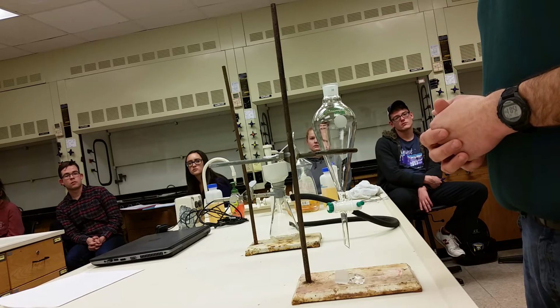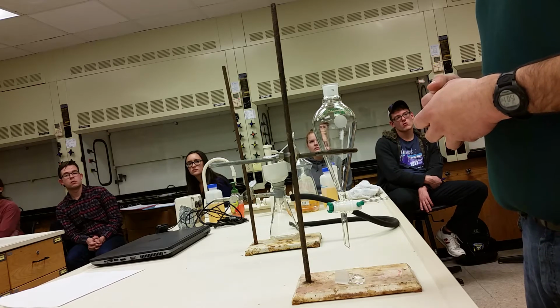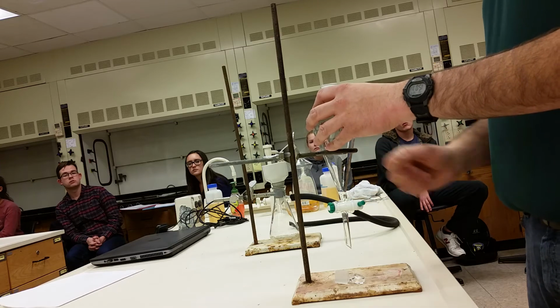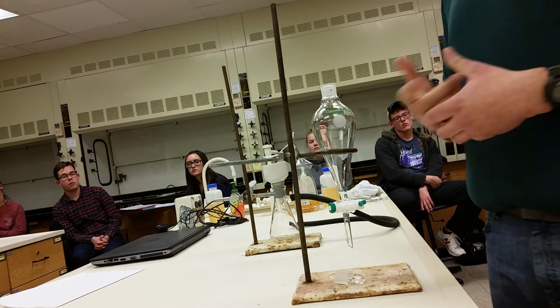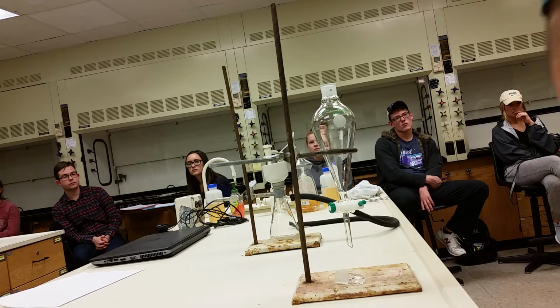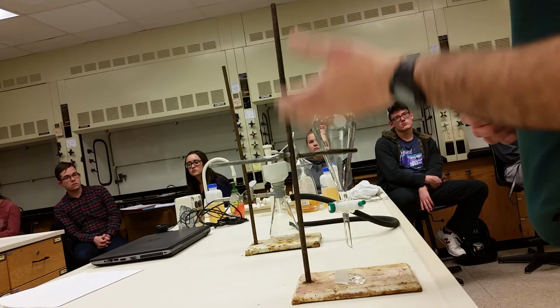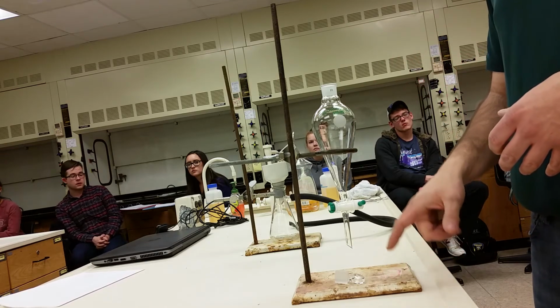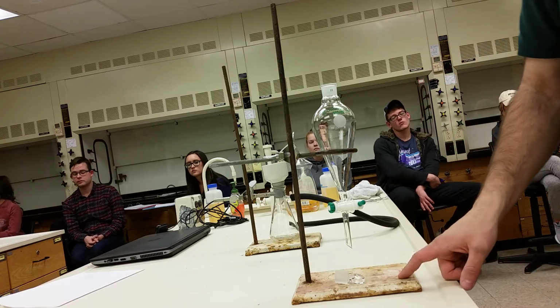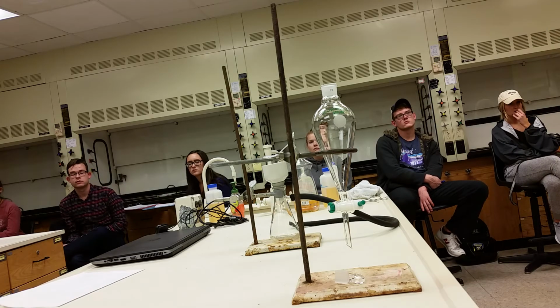Add until you get to the ethyl acetate layer. Keep the stopcock open until you get to the ethyl acetate layer. Close the stopcock, then repeat. Put 10 more mils in of the sodium hydroxide. Put the top on. Shake it, vent, shake, vent, shake, vent. Once you've done the separation 3 times, you should have 30 milliliters of 5% sodium hydroxide in your Erlenmeyer flask.